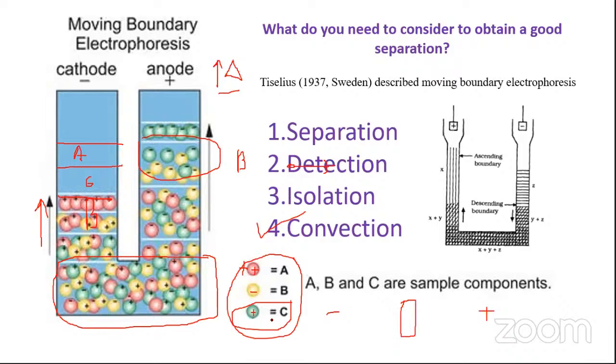Because the solvent is the medium in which you have suspended your solute molecules. So if there is heat production, will they not be getting energized due to heated solvent molecules, and those heated solvent molecules will strike your solute molecules as well, setting them into motion? Will this not happen?